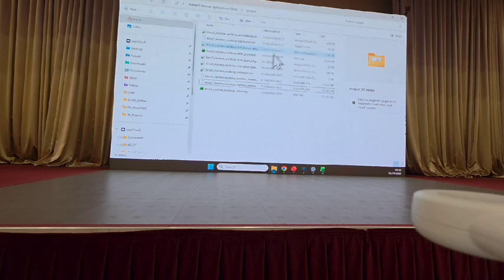And here are the different exports you can use for different post-processing tools. So right here is a GNPS MGF. Unfortunately we won't go into that today, but you could use this file to analyze your feature table on GNPS or GNPS2.